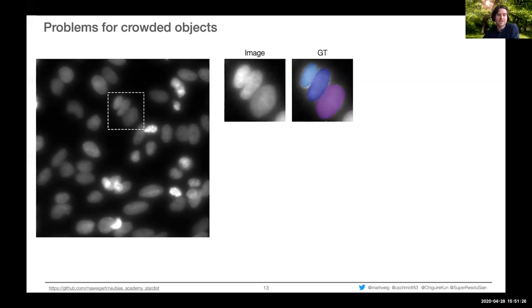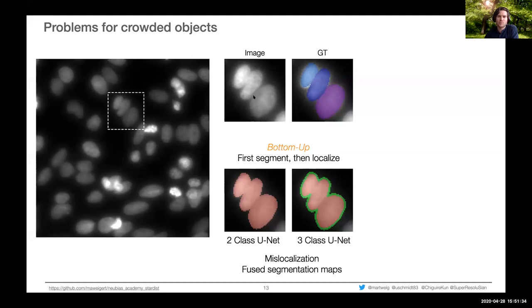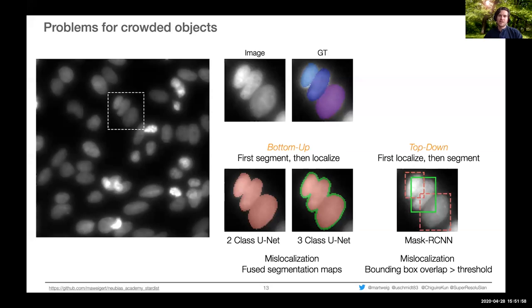The problem with both approaches in crowded, noisy images: in bottom-up, touching crowded objects get merged because foreground-background segmentation fuses nearby cells. In top-down, bounding boxes are poor approximations of nuclei shapes — the bounding box of a central cell may overlap too much with neighbors, causing those neighbors to be suppressed, leaving only the central cell. Both lead to mislocalization.